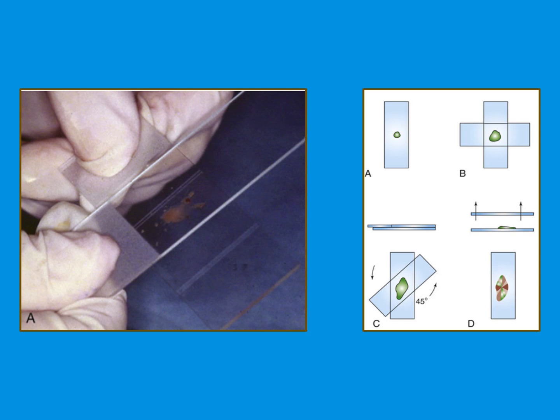Otherwise, the cells may be ruptured. But we expel the sample onto the middle of one slide, and then we place a second slide, the spreader slide, over the aspirate, horizontal and at a right angle to the first slide. As you can see in step B here, the spreader slide is then quickly and smoothly slid across the prep slide. So downward pressure should not be placed on the spreader slide because this may cause cell rupturing, making the sample unable to be interpreted.